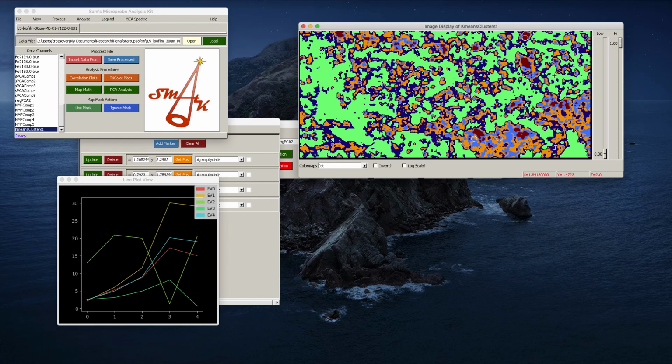And I may be able to get useful information out of knowing that there are these different clusters of pixels where the signal is more similar to the other pixels in that cluster than to pixels from another cluster. So that concludes our tutorial on statistical tools for image analysis. There is one additional tool, simplex volume maximization, that is covered in a separate tutorial.